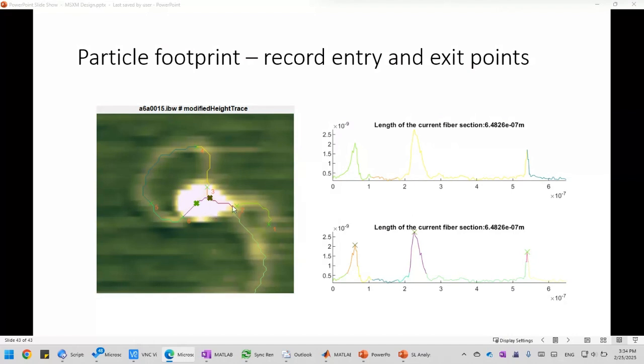If we can know the range of the section that it binds on the DNA, then we have more precision in knowing what sequence it binds to and what DNA structure it binds to, right? But if we just know the position of the peak, then that does not give us an accurate depiction of its location.